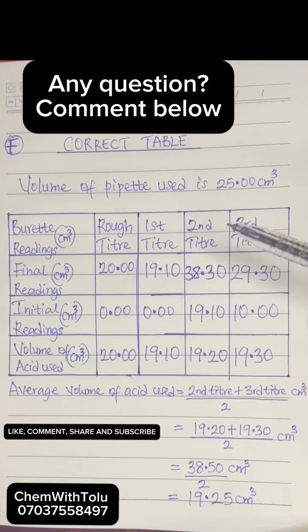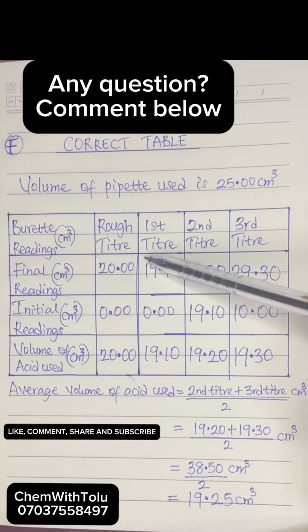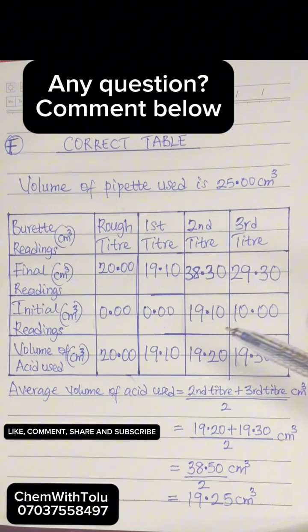You can see you have 19.20. And then the next one for the third titer, that's 29.30 minus 10.00, 19.30. So you can see all these are very, very correct, 2 decimal places, and there is no arithmetic error, and there is no omission of table. There is no alteration. Can you see now? There is no alteration of any value, and there is no burette reading error. No burette reading error of maybe 51 point something, 50.8, no, 15.1, no.